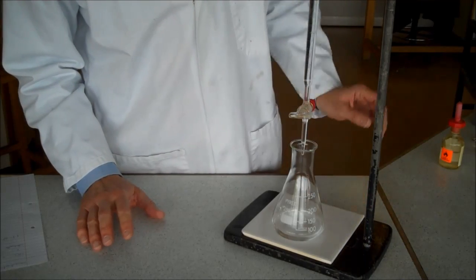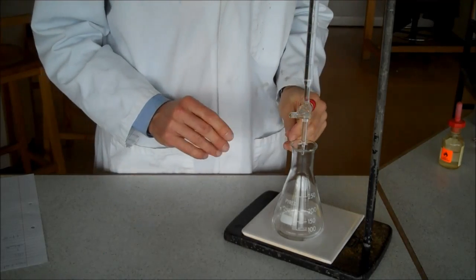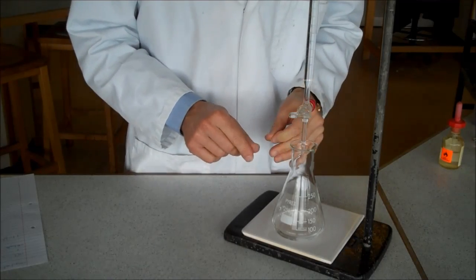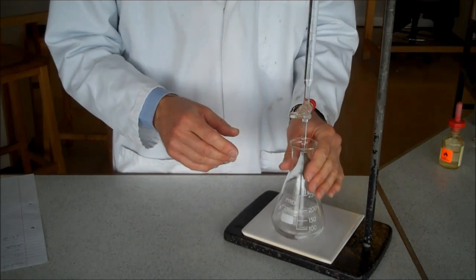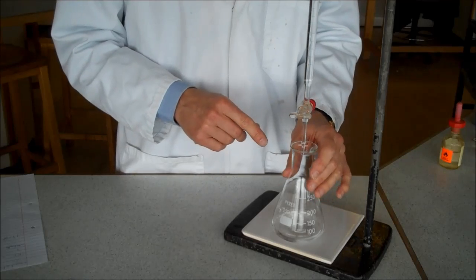Now, the amount of acid I've added is about 11.9 centimetres cubed. That's my rough result. I'm not actually going to use that in my calculations, but 11.9 gives me a rough idea of how much acid I need to add to exactly neutralise my alkali.